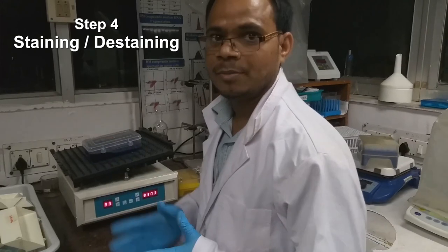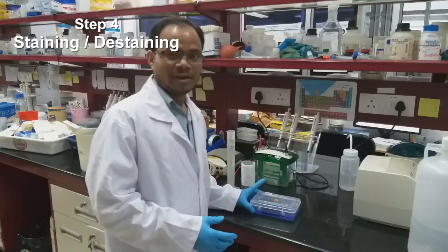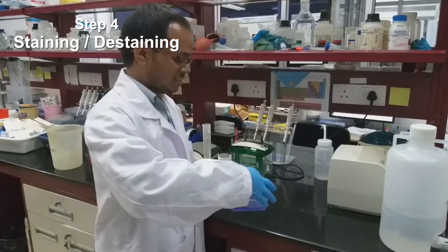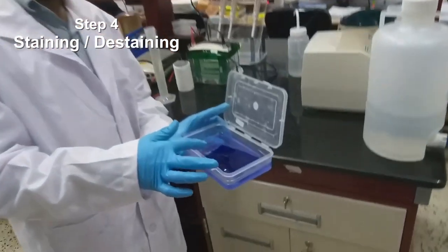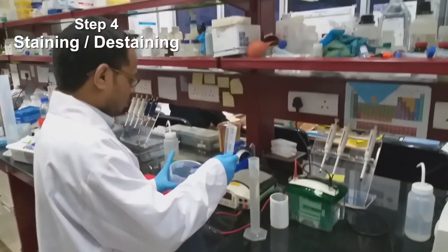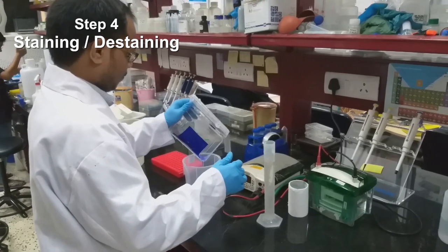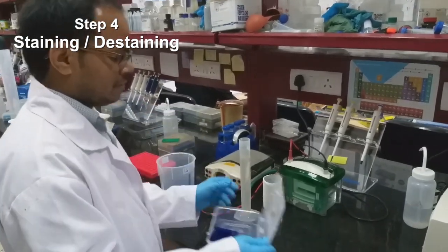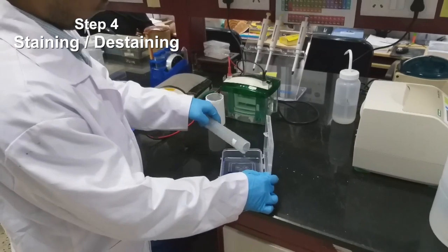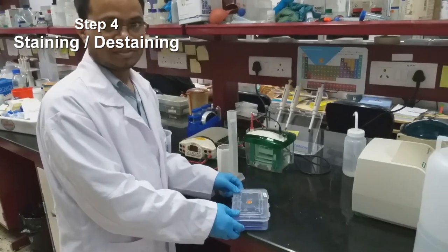So once the time is over, after 2 hours, we will de-stain. Now we kept 2 hours in staining solution. As we can see, the staining is over. Like you can see, the gel completely turned into blue. So we remove the solution. Then I am going to add de-staining solution, and I will keep this on a rocker for 2 hours for de-staining.